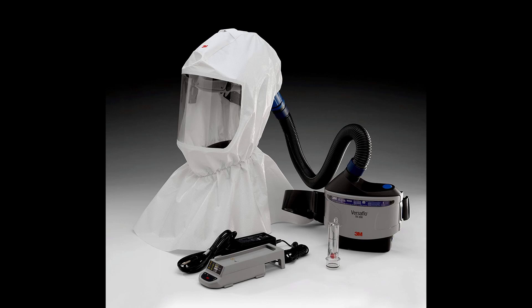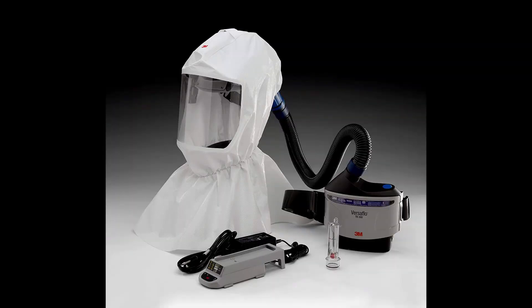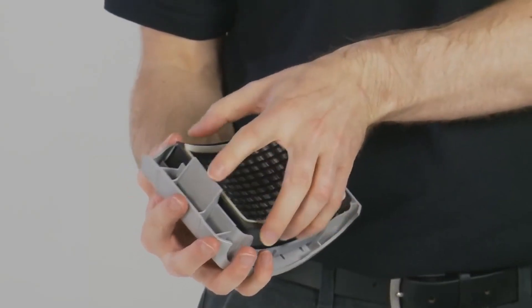What does the PAPR consist of? Each unit consists of a hood, a helmet, or a headpiece, a breathing tube, a PAPR blower, and a filtration unit with battery pack and belts.